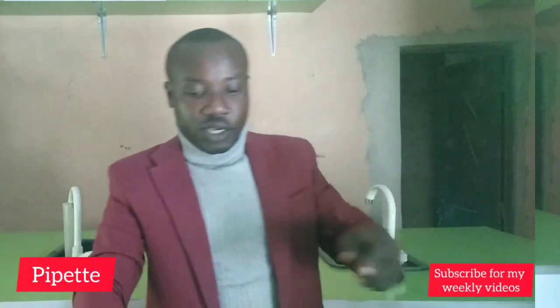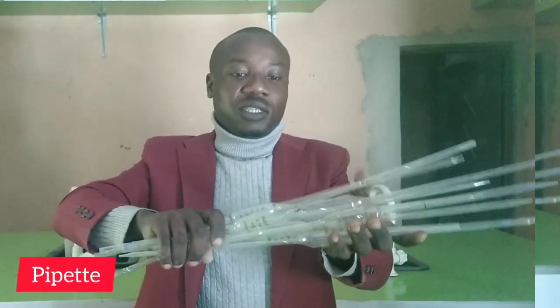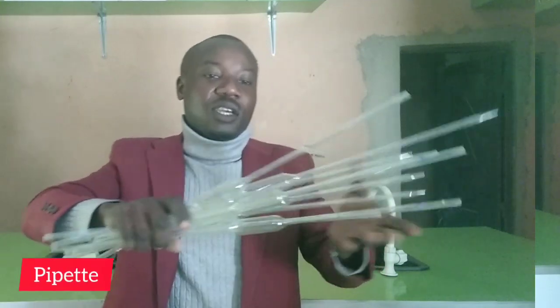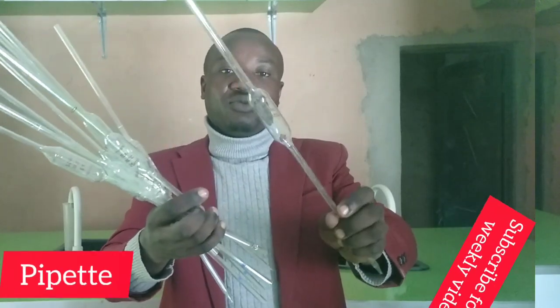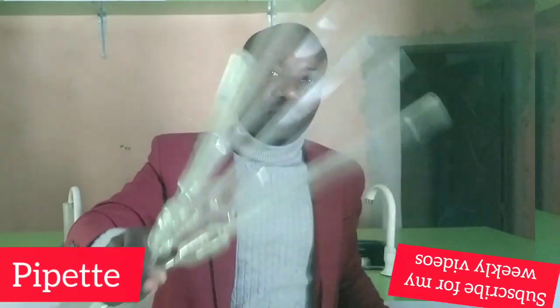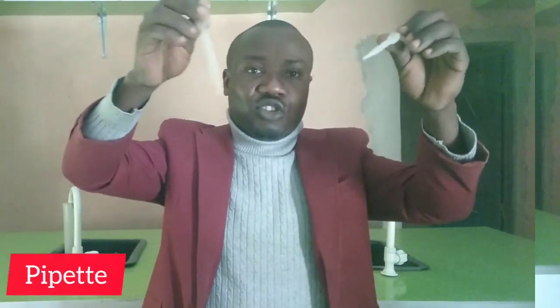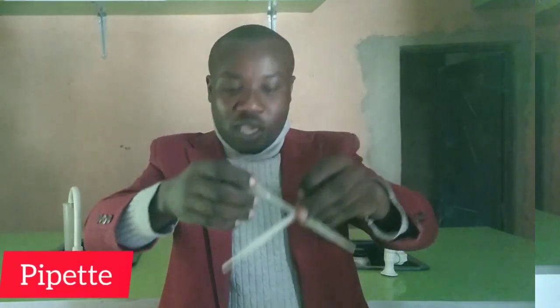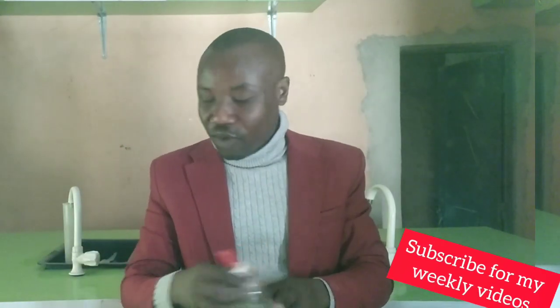Secondly, let's look at the pipette. This is a pipette, as I taught you in the second part of my chemistry practical. This is a 25 ml, and I also have one of 20 ml. This one is called the bulb pipette or the transfer pipette. This other one is also a pipette, but we call it a dropping pipette. This one is a dropper; we use it for dropping.